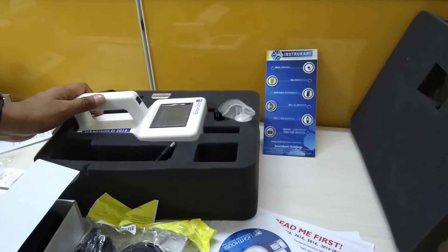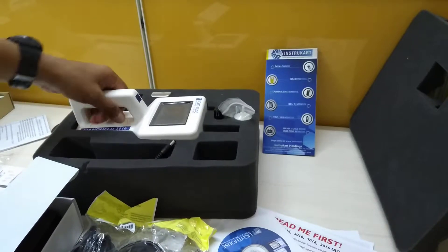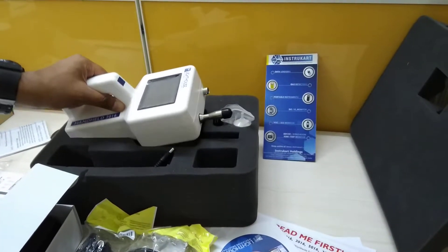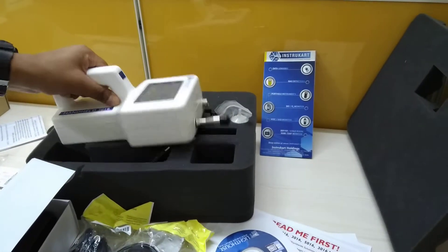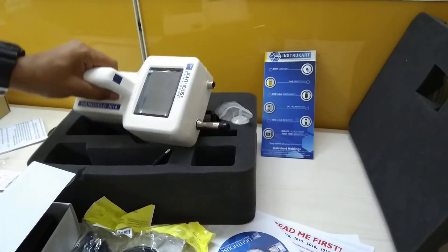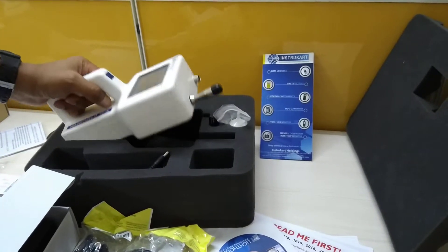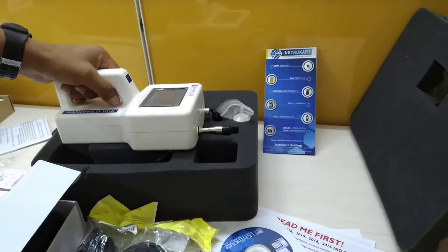Hi, welcome to InstruCart, your worldwide instrument partner. We have the Lighthouse particle counter 3016 today for a small review. I'm going to show you what instruments you'll be getting with this handheld particle counter.